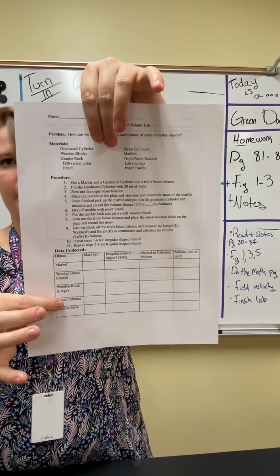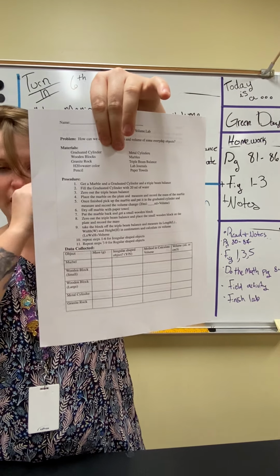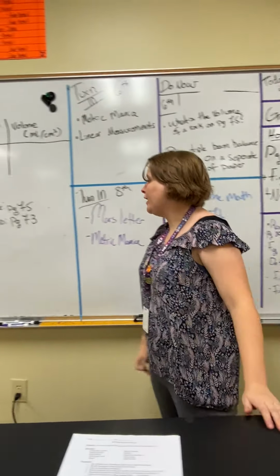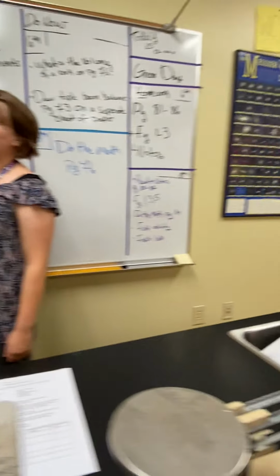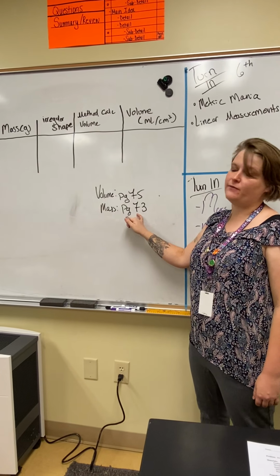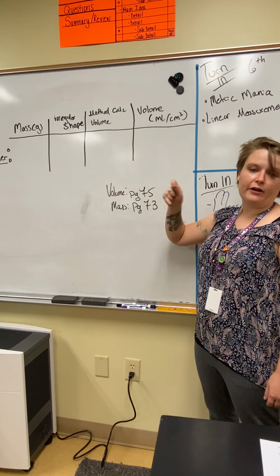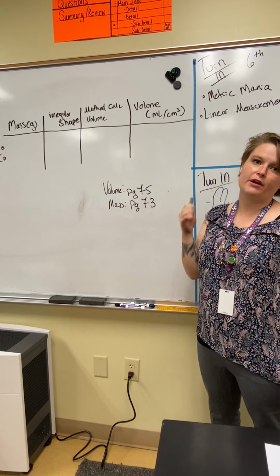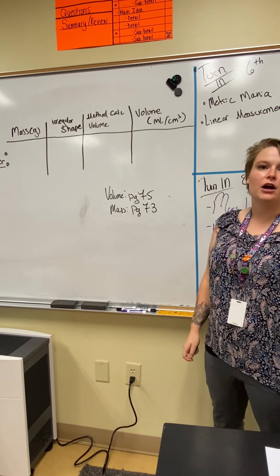We are starting with the metal cylinder. So fill this in as we go. Now, if you need to know how to mass an object using a triple beam balance, go to page 73. Read it. You should have already read it. Then go to volume. If you need to know how to calculate volume of an irregular shaped object, for us, a cylinder is an irregular shaped object, you can go to page 75, all right?